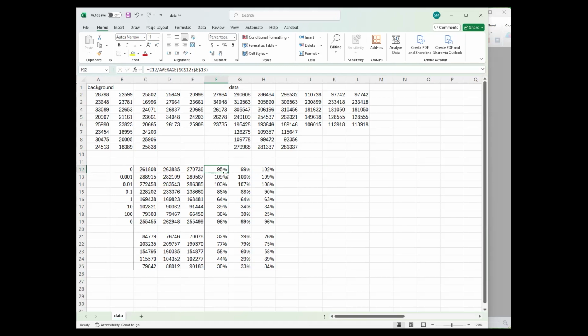Or if you're really low here, what you can do is use the 0.001 as the total binding. And so that's what I'm going to do here. And I'm going to delete out the zeros because you can see there. I mean, you can use them, you cannot. I'm just doing this for demonstration purposes.